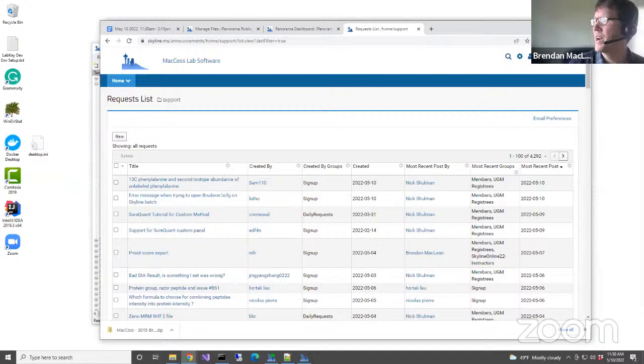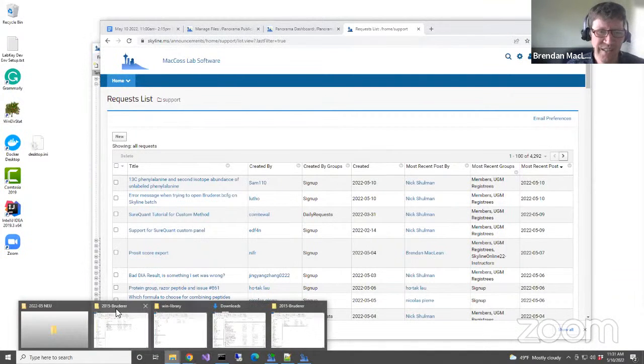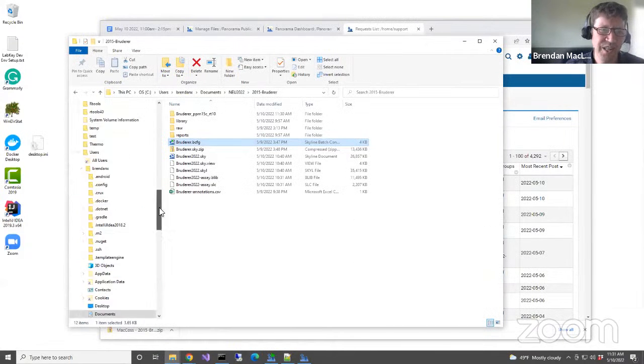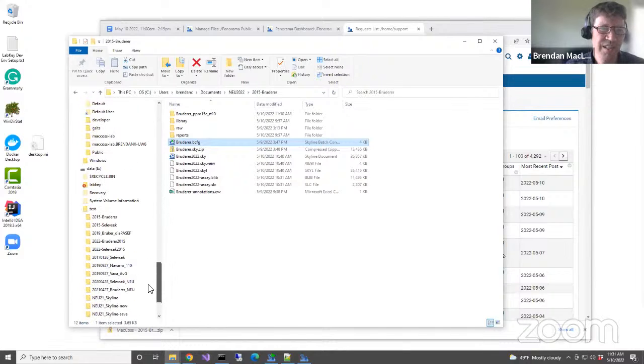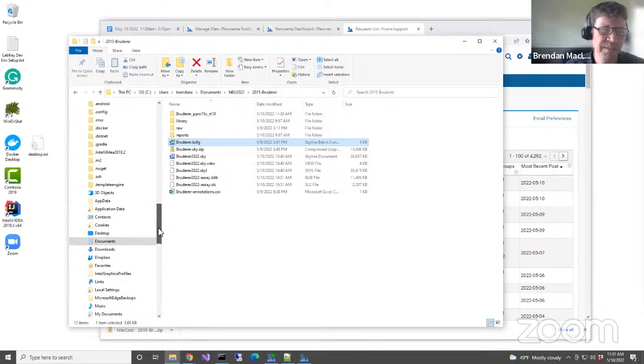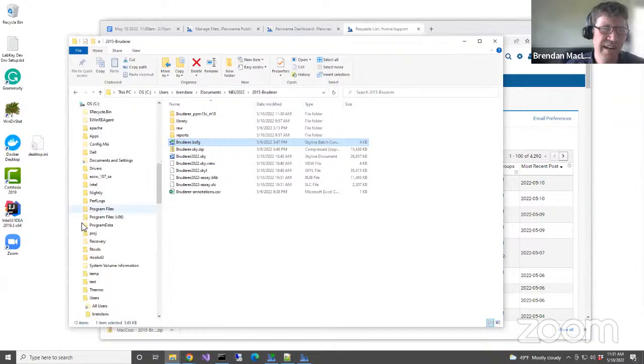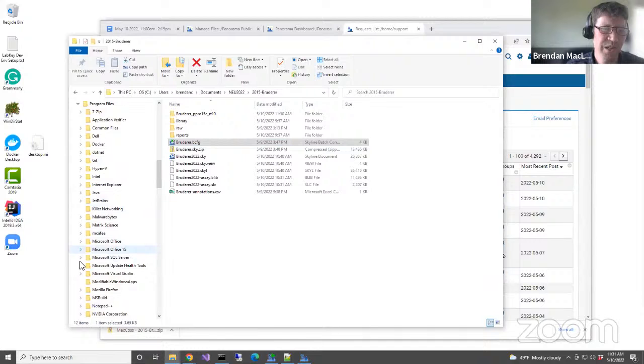To follow up: at our location, it can't find R in folder R 4.1, which I use regularly and successfully installed MStats. Am I out of luck? Yeah, are you sure? What is it looking for in these folders? Again, you could post this to the Skyline support board. These types of questions require troubleshooting, which I may or may not be able to do quickly here.